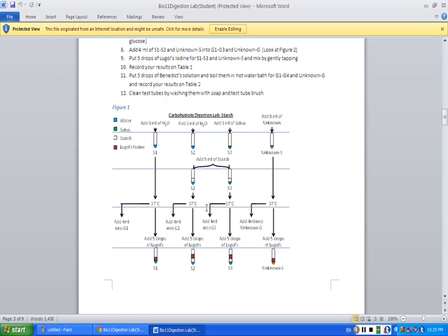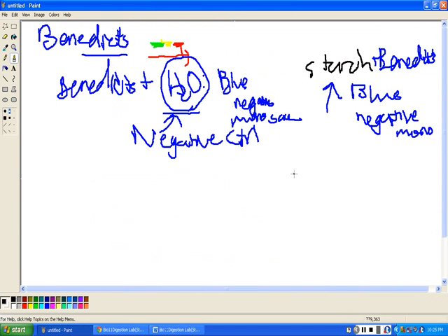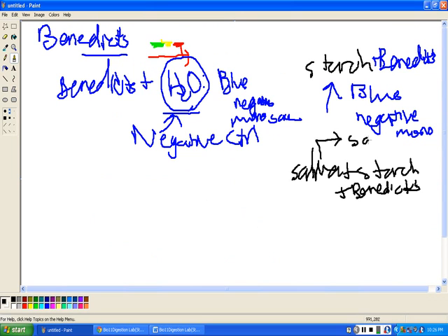And this other one here, we have the saliva mixed with starch, and then we let it incubate for a little bit. So we have saliva plus starch, and then plus Benedict's. And of course, remember, saliva has what kind of enzyme again? Salivary amylase. And what does that do? Where is it found? It's found in the salivary glands in our mouth, oral cavity to be more precise. That's going to digest the starch into maltose and eventually into glucose.